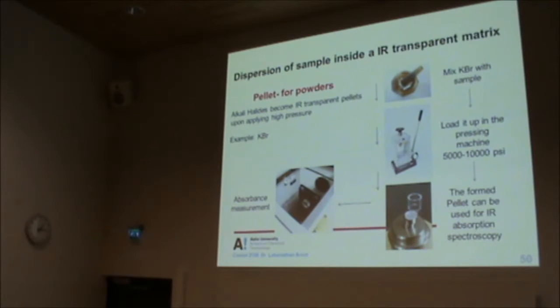Now, potassium bromide forms a pellet much more easily when compared to sodium chloride. That's why we use potassium bromide very commonly. But the disadvantage is potassium bromide absorbs water from the atmosphere more easily when compared to sodium chloride. So if you want to make a fresh sample, then KBr is best. But there are situations where it's good to use sodium chloride plates. I'll give you examples where each of these is important.